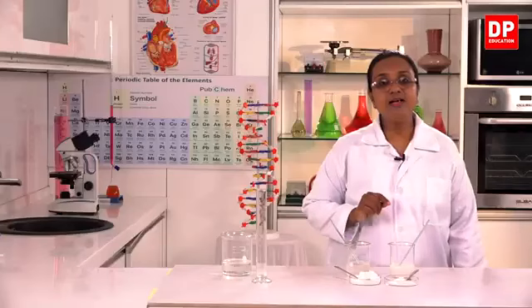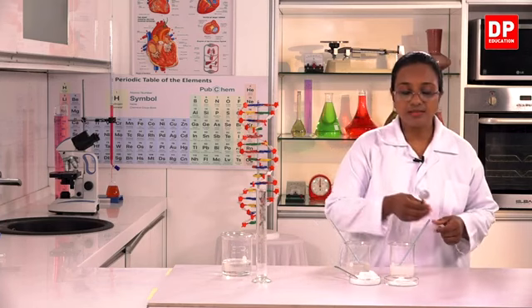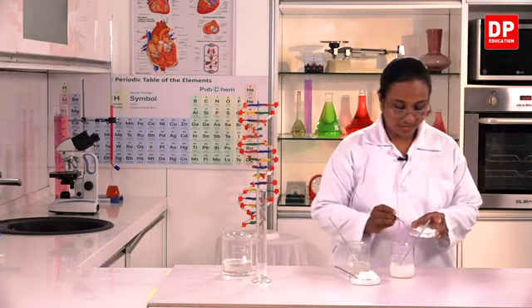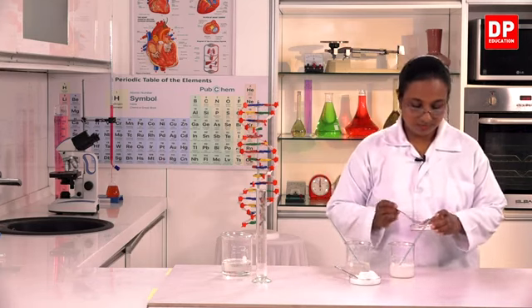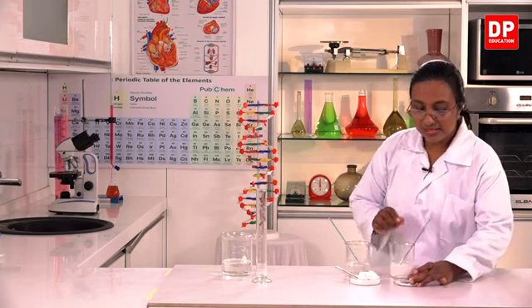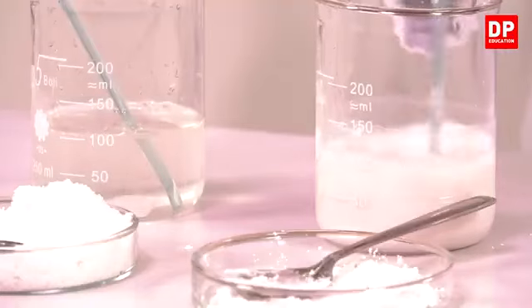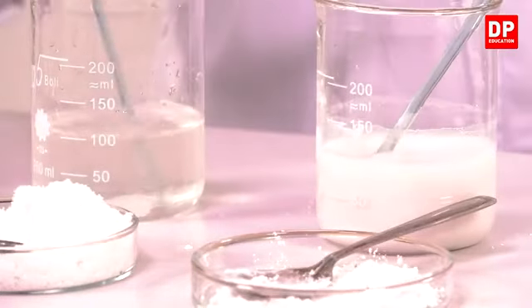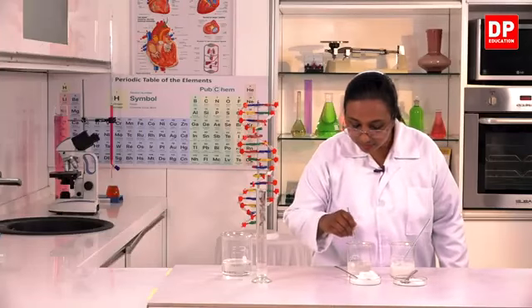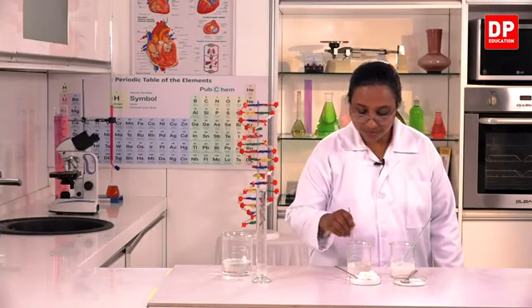So since I added 3 spoonsful of sodium chloride to this, I will add another 2 teaspoonsful of calcium hydroxide into this other mixture, so that we can easily compare the nature of the two mixtures. There is a little bit more of the sodium chloride that is not dissolved. So I am dissolving that as well.